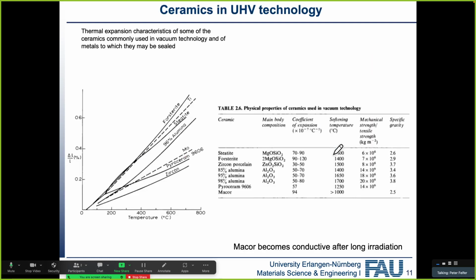Okay, so this was the chamber material, but of course we also need other materials. And the materials we typically need are materials that either thermally insulate or thermally conduct, or electrically insulate or electrically conduct, because these are the typical requirements that you have, and combinations thereof.